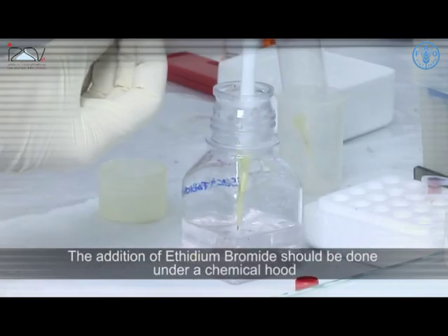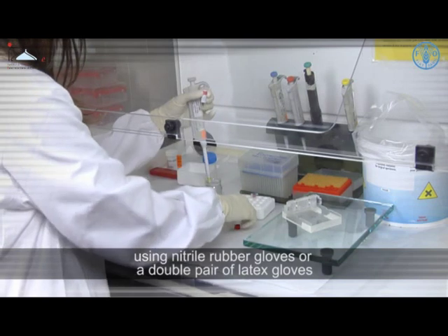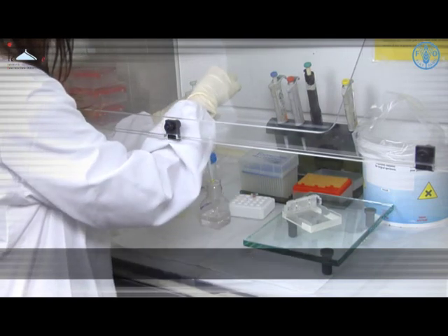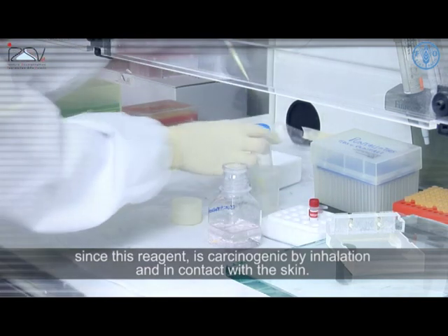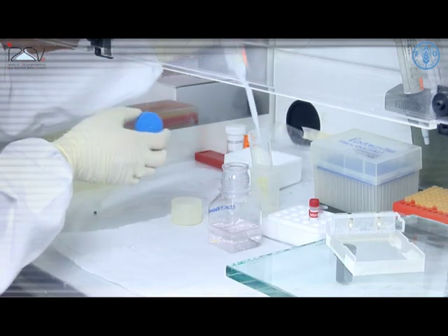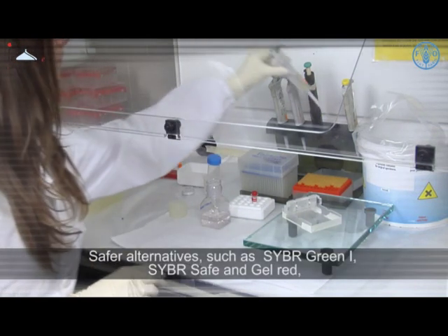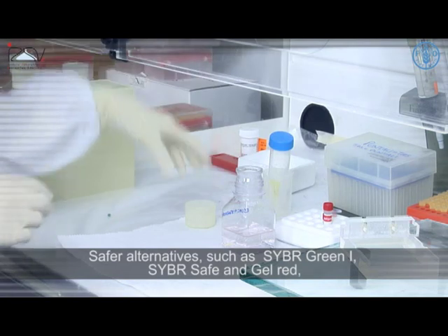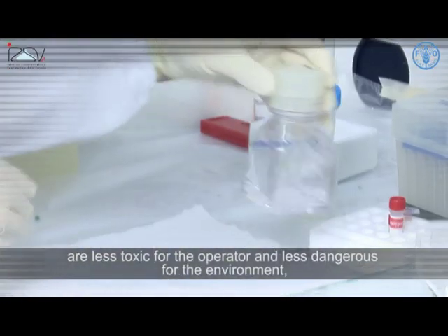The addition of ethidium bromide should be done under a chemical hood using nitrile rubber gloves or a double pair of latex gloves, since this reagent is carcinogenic by inhalation and in contact with the skin.